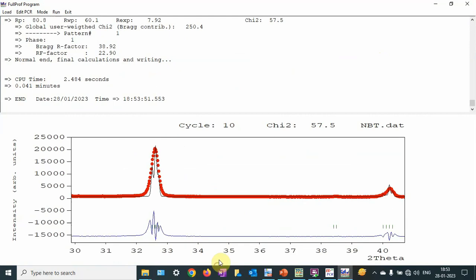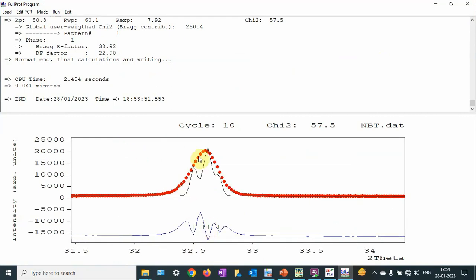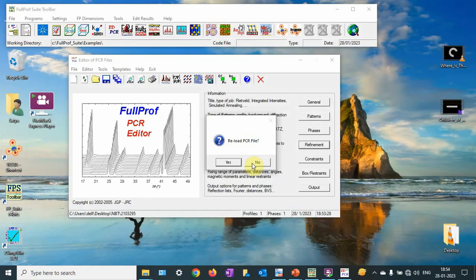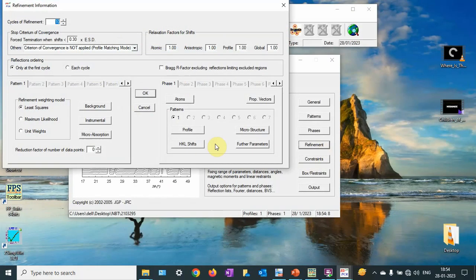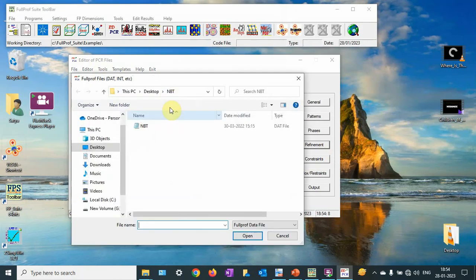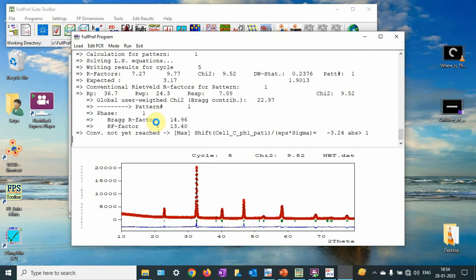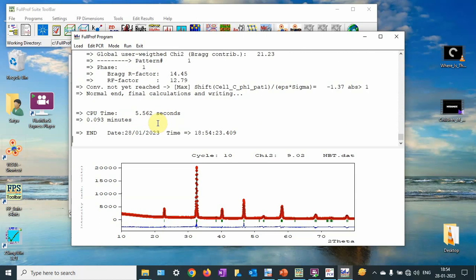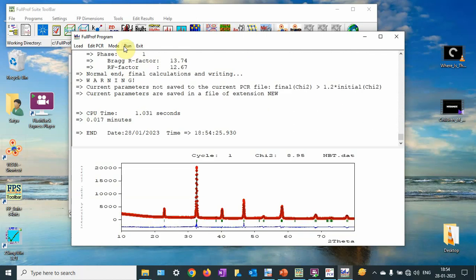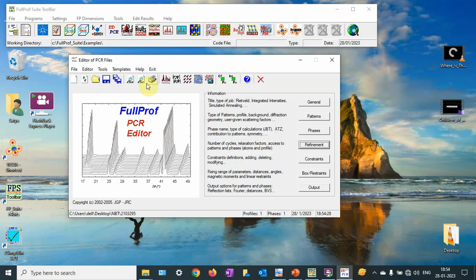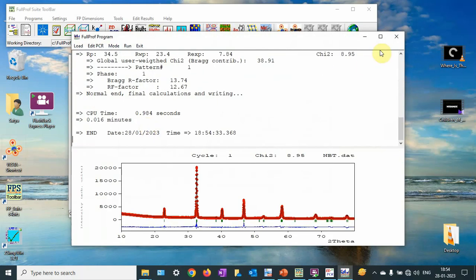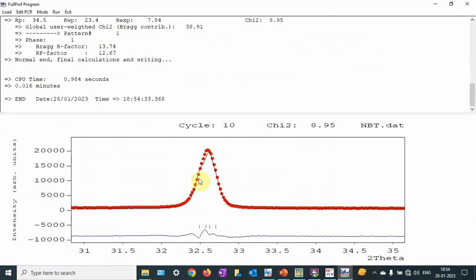You can see that peak positions are matching and peak height is matching, but peak shapes are not matching. So I am going to use the peak shape parameter. Let me refine that. Now you can see that we have got a very good fit here. Run it again — so 8.95. Peaks are almost getting matched. Peak background is fine, peak height is fine, peak positions are fine.